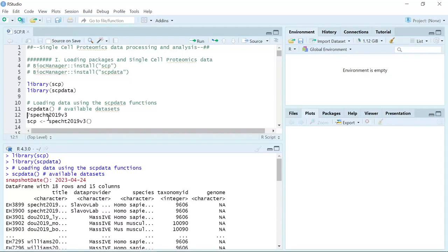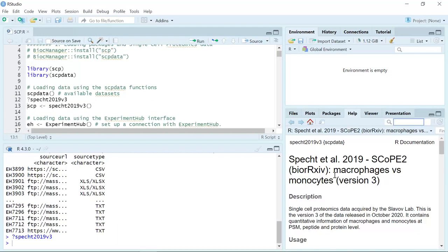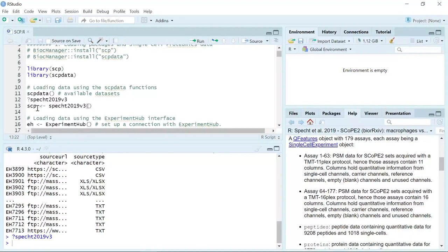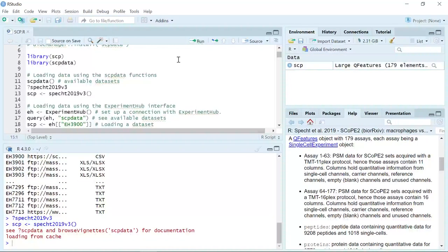We are going to use the SPECHT 2019 v3 data set as an example to show you how to load the data from the SCPdata package. We can use the question mark together with the title of the data set to look at the information for each data set. Let's run the SPECHT 2019 v3 data set — you can see here is the information about this data set that we are going to use for our tutorial. So we can load this data set as SCP. This is the full data set. You can see we directly loaded the SPECHT 2019 v3 data set into RStudio and it is a large QFeatures data set.